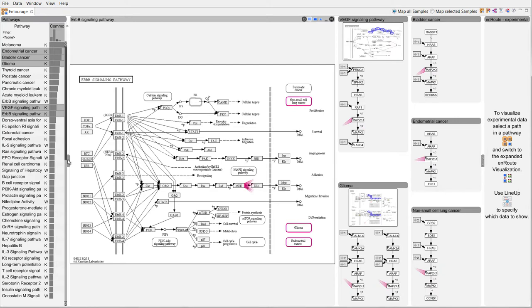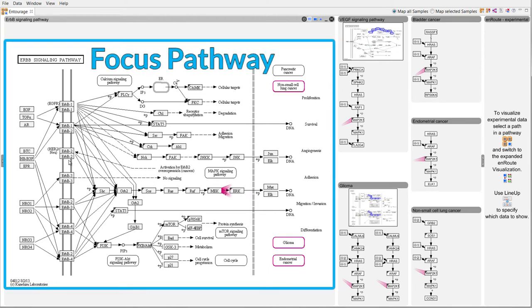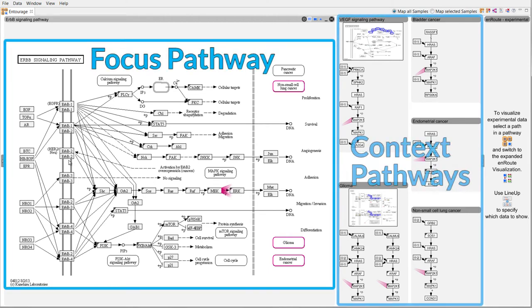To get more display space for pathways we hide the pathway list. We distinguish between a focus pathway that is shown at full scale and context pathways that show only relevant parts.